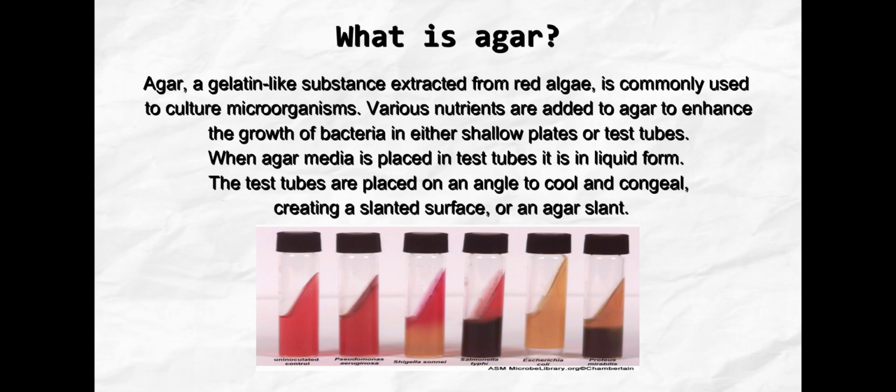What is agar? Agar, a gelatin-like substance extracted from red algae, is commonly used to culture microorganisms. Various nutrients are added to agar to enhance the growth of bacteria in either shallow plates or test tubes. When agar media is placed in test tubes, it is in liquid form. The test tubes are placed at an angle to cool and congeal, creating a slanted surface or an agar slant.